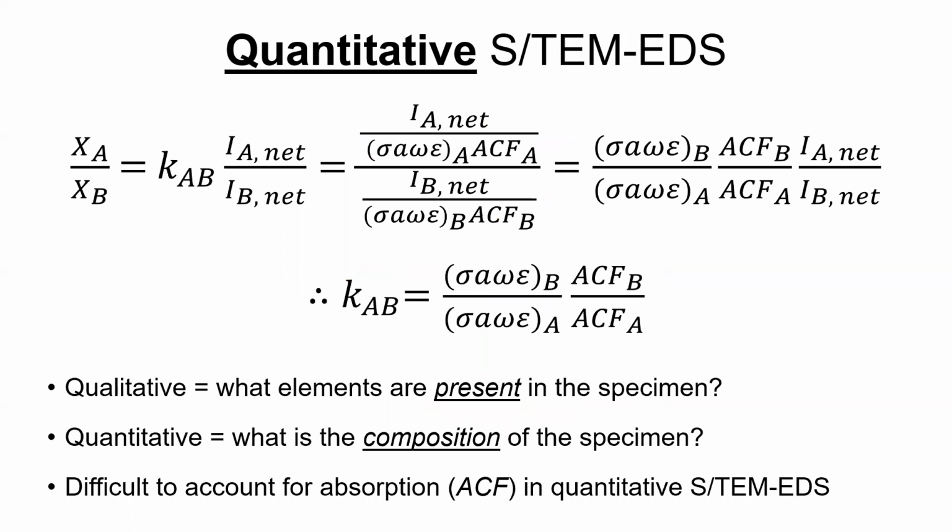Because this is really the heart of how this works. And I want to stress that the math we're going to go over today is unique to EDS in the STEM. You cannot apply this to, say, the SEM. I want to make that very clear because of the nature of your samples in STEM, as well as the electron energies that you're using in STEM.